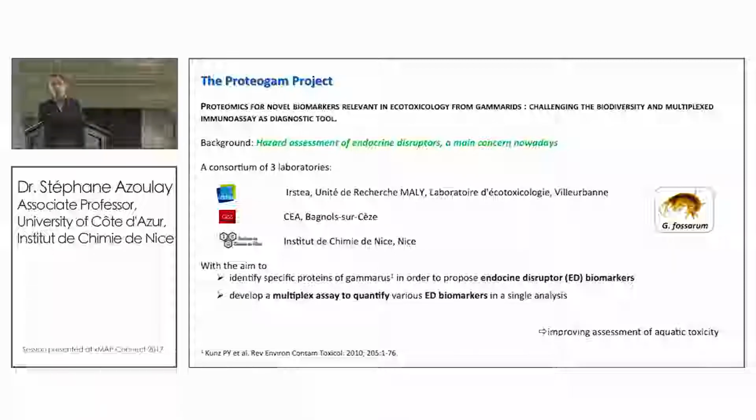That's why we focused on multiplex technology. You can use HPLC and MS technology to follow biomarkers, but it is more difficult to transpose to all fields.